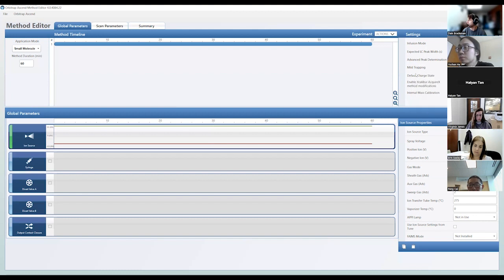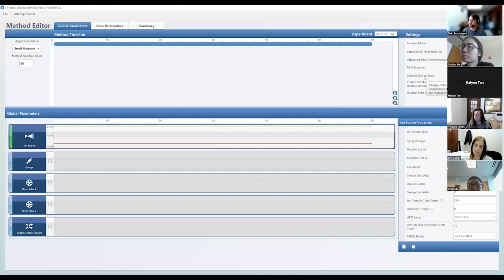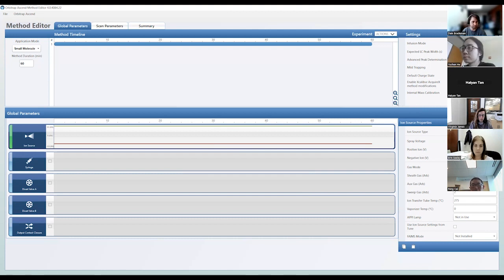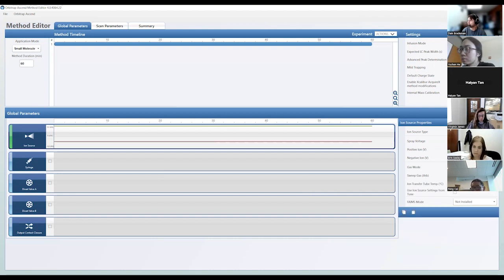Up to this point I've left mild trapping off, and for default charge state for lipids I leave that as-is since most lipid species tend to be singly charged. The instrument does a pretty good job calculating multiply charged species, but if it's unable to calculate a charge state for a particular peak, it'll assign it one by default. We don't run with AcquireX yet, and we don't use internal mass calibration. For ion source type, we usually use nanospray ionization — NSI — but this depends on your LC setup.